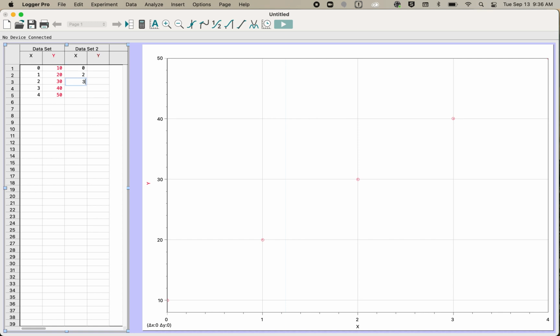So at this point, if I put some other information in, and I learn to count, let's say something along these lines. All right, the problem you'll notice now is we've got these red numbers, and I've got some red dots here. These are a maroon color, and I don't have any data set over there. So in order to get that to be plotted after I've entered in all my information, I need to click and select the graph. Make sure your graph is selected.